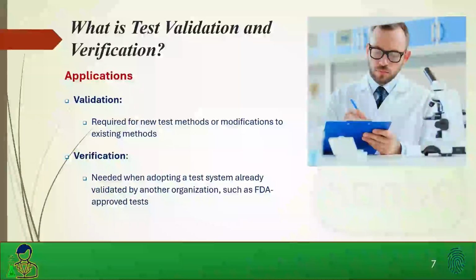So oftentimes, the reagents, whatever it is, you can't really change the reagents. You have to specify what the manufacturer's guidelines are, follow the recommendations, follow everything. And if you follow everything properly, then you only have to do a verification instead of a full validation.